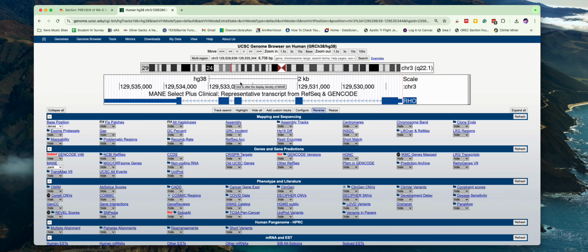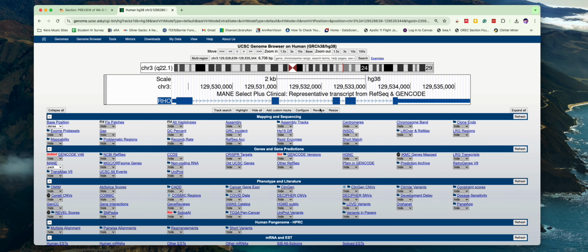And the region being shown to you is usually up here, chromosome 3. You can see this is the base number in the chromosome that are being shown here in this window. The little chevrons show you the direction of the gene. If you're thinking that you're looking at this backwards, what this is telling you right now is looking at this chromosome, this would be on the bottom strand, going that way. You can hit reverse if that happens to be on and flip any gene around to look at it. And you can see the chromosome ideogram flipped around, and so is the gene structure.